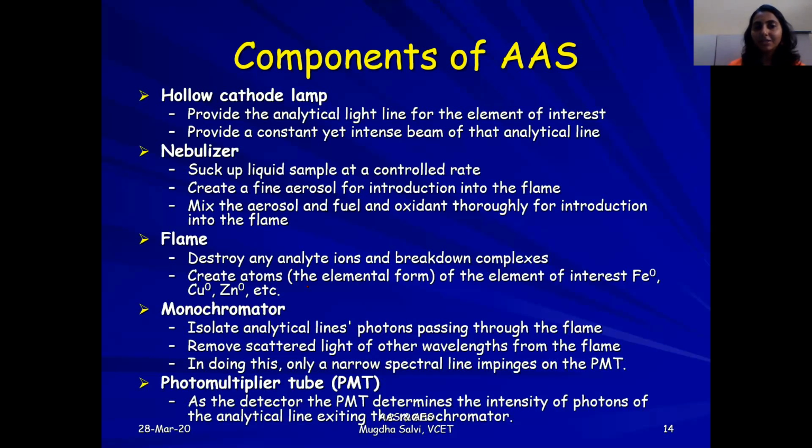It creates atoms, the elemental form of that element which is of interest. It could be either iron, copper, zinc, sodium, potassium, or calcium.